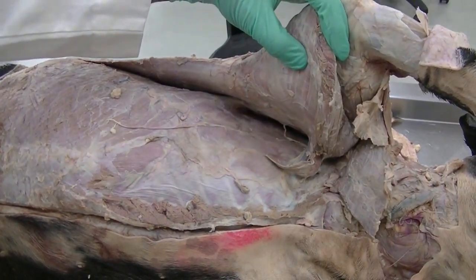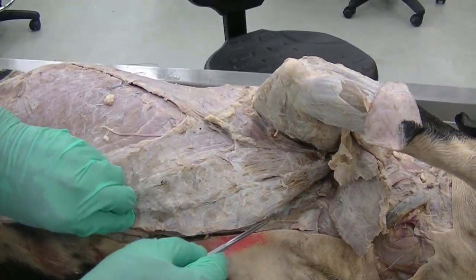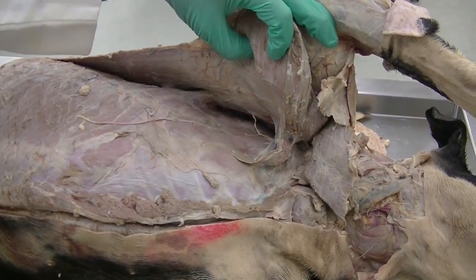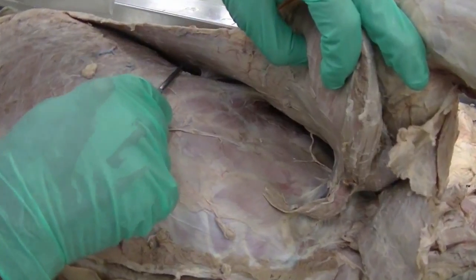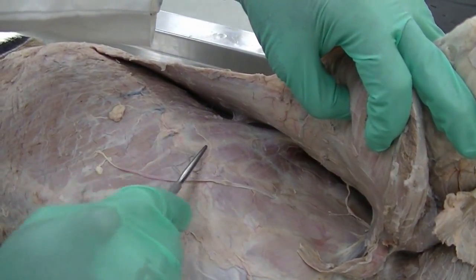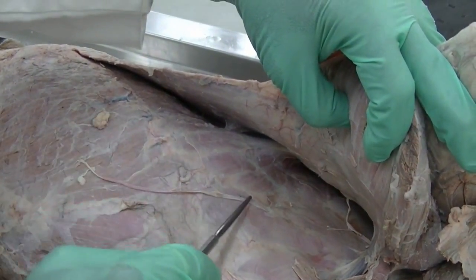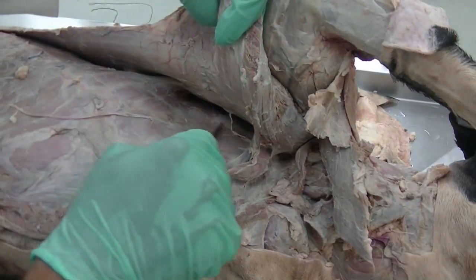Now we are looking at the forelimb after transecting the deep pectoral muscle as well as the superficial pectoral muscles. We try to push the forelimb away from the trunk, and we see another extrinsic muscle, which is the largest one, has its serrated edge which connects the scapula from its medial aspect to the rib cage as well as to the neck. This is your serratus ventralis muscle.